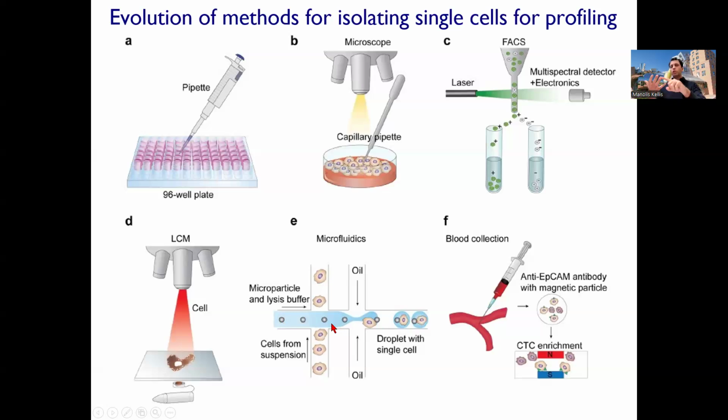Let's say AGGTTCA for some cell, and then TGACCGG for another cell. And then every time you see the exact same barcode, you know that it was the same capsule and therefore most likely the same cell. And then by adding these capsules with oil, you're using the physics properties where the lysis buffer and the oil are not mixing, therefore causing this lysis buffer to sort of clump inside one of these chambers, one of these bubbles, that basically becomes your reaction chamber. Everybody with me here?